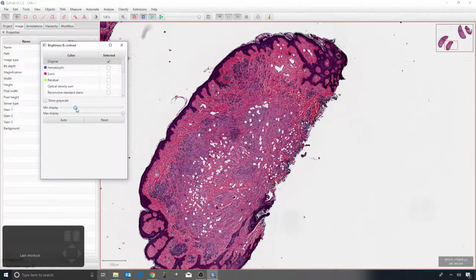In this case, we have an 8-bit image, and that means that the pixel values are of the range from 0 to 255. If I move a mouse over the image, you can see in the bottom right hand corner what the values of the pixels are. And we have 3 values, one for the red, one for the green, one for the blue channel.